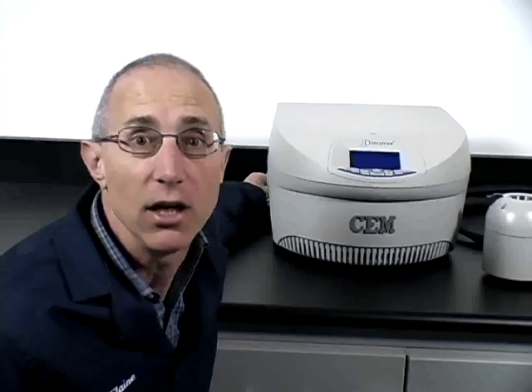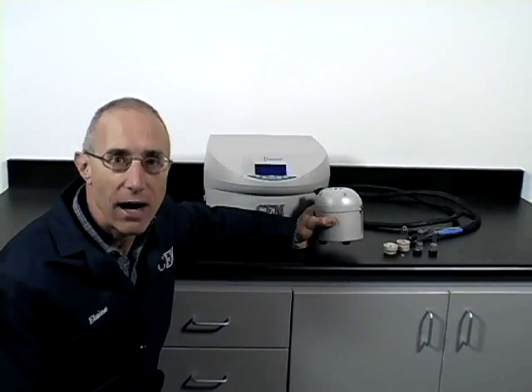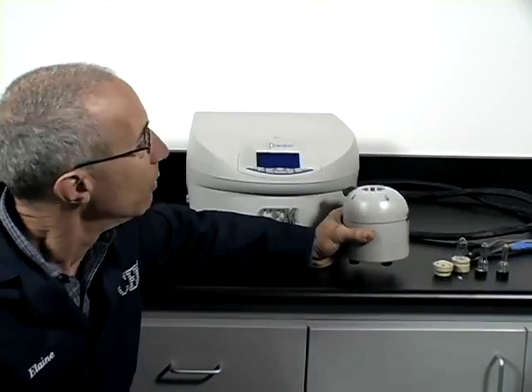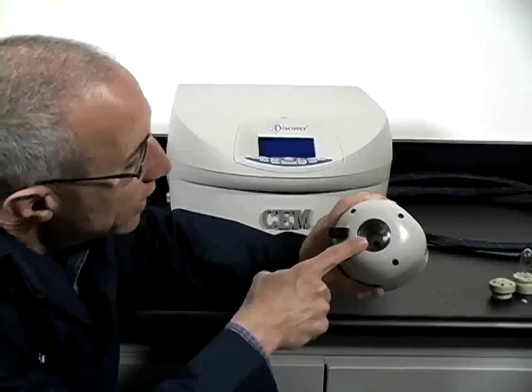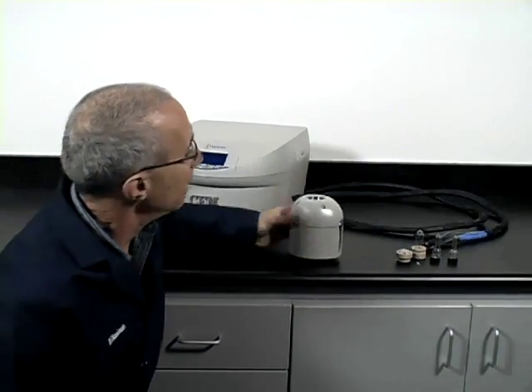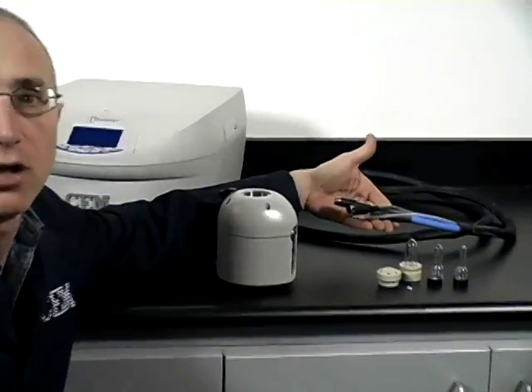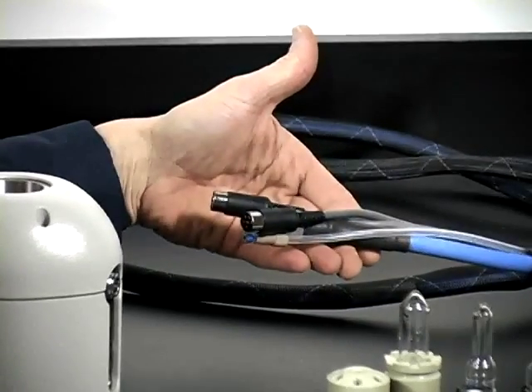Now we're going to move on to the components of the CEM PetWave. First, the main component is the remote microwave applicator. This is what would sit inside your glove box or hot cell. The remote microwave applicator will accept vessels in the top side of the applicator. It's connected to the generator controller via a set of cables, and this is the cable bundle. You can see the end of it — these will connect to the remote microwave applicator, and we'll show the connections a little bit later on.